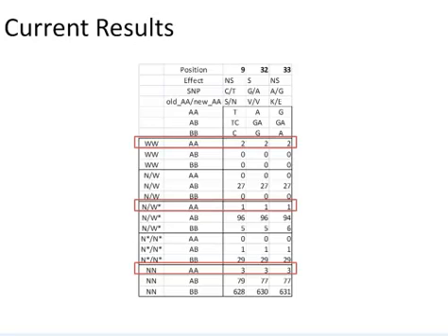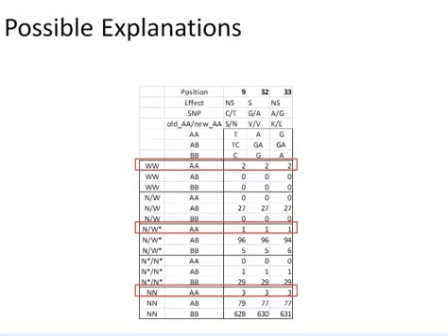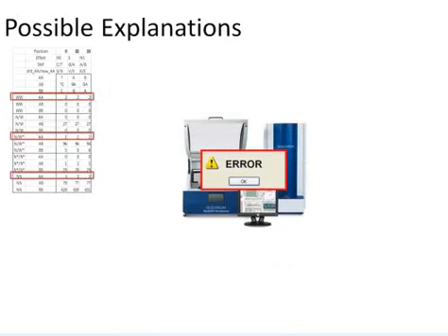But there's a slight problem. One of our carrier animals is homozygous, and 3 of our non-carriers, or 3 of our normals, are homozygous. So why is this? Why do we have 4 animals that are not supposed to be affected, but they're homozygous? Well, there could be a couple of explanations. One of them is just a genotyping error. So we went back and re-genotyped those animals, and we looked at the signal strength of those SNPs.